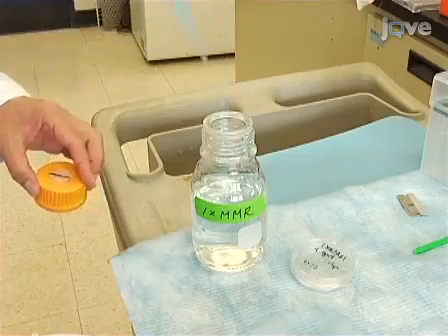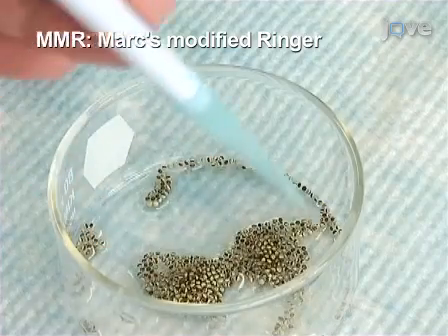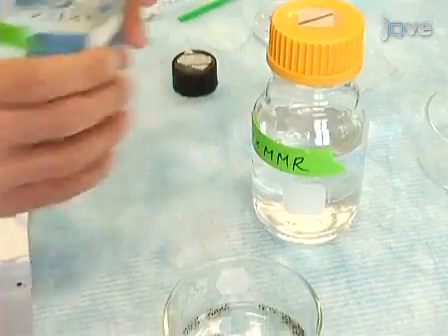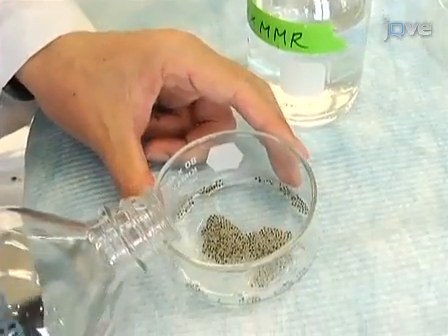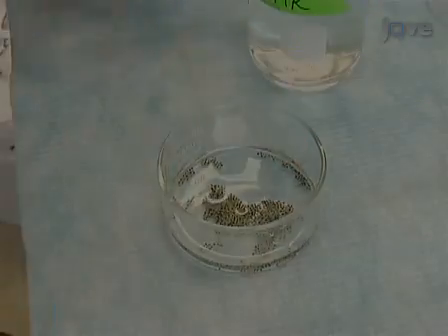Add 0.5 to 1 milliliter of 1x Marc's Modified Ringer solution onto the eggs and fertilize them in vitro with a small piece of dissected testis. After 2 to 3 minutes, lower the salt concentration with 0.1x MMR to activate the motility of sperm.